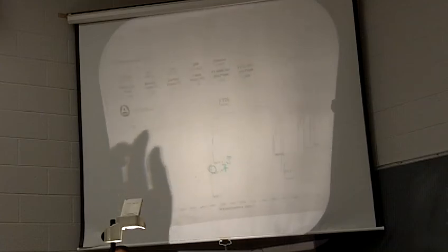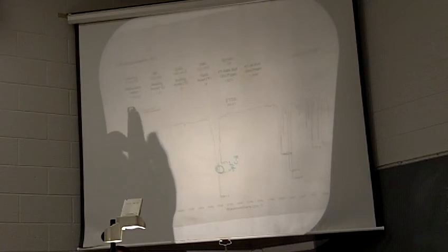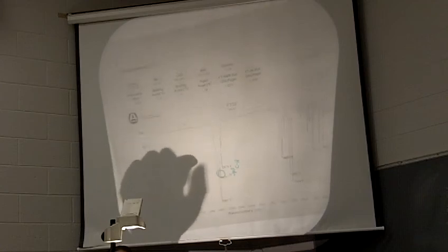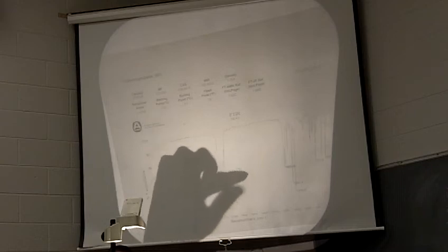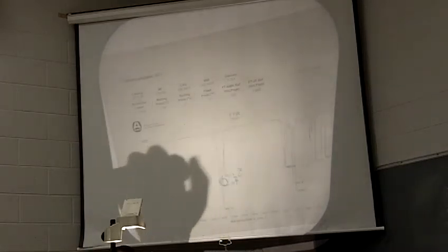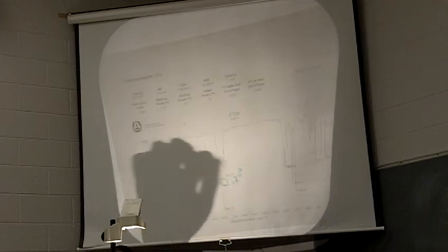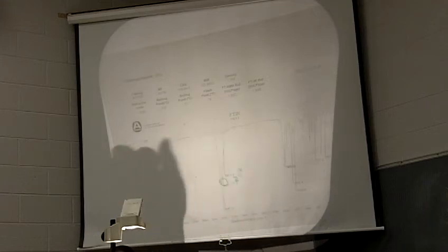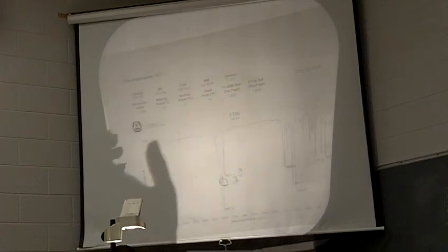Here's the bromopropane that we looked at earlier, except for this is one bromopropane. There, besides the sp3CH stretch in the alkanes, there really isn't anything else to see there, okay? So you're not going to see anything else in this area except for your CH bending. But you won't see an OH stretch, you're not going to see any alkenes, you're not going to see any ketones.